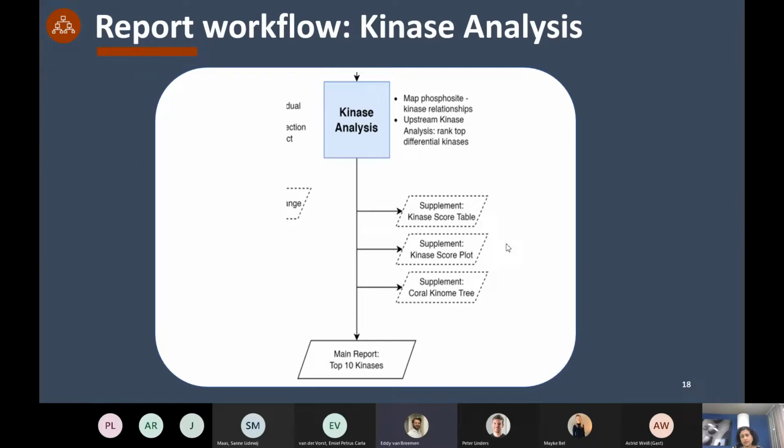And at the kinase level, we are now looking at how sets of peptides are mapping to a specific kinase derived from our databases, but of course, how this actually changes in your data. So that's the functional scoring tool that we have. The end result of this is a ranked list of kinases, both serine, threonine, and tyrosine, that are differentially phosphorylated between any two conditions.